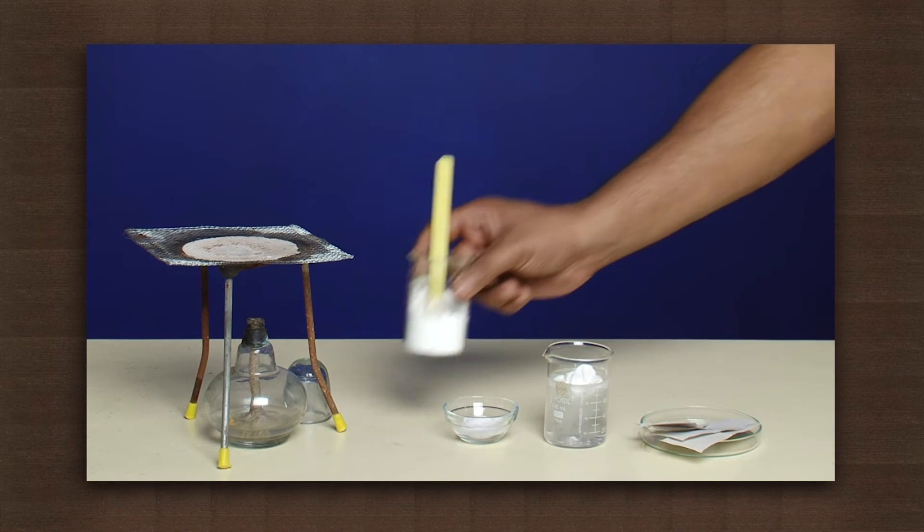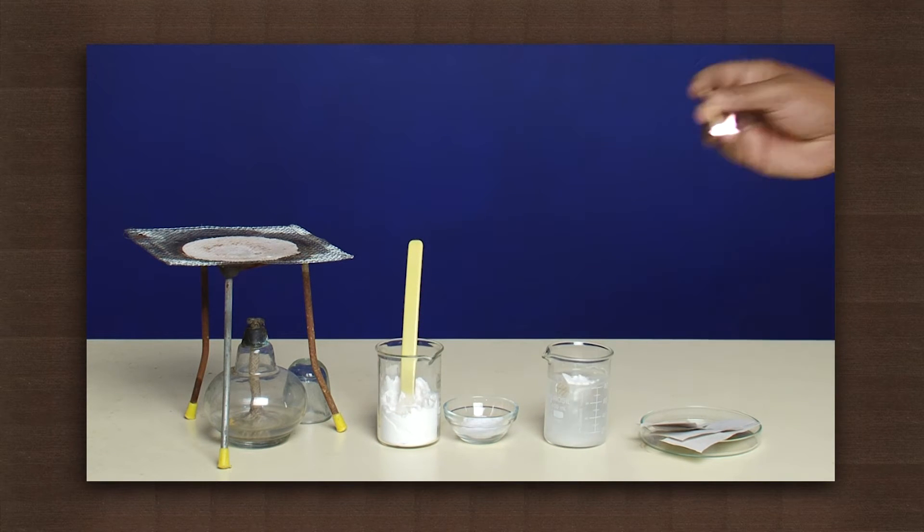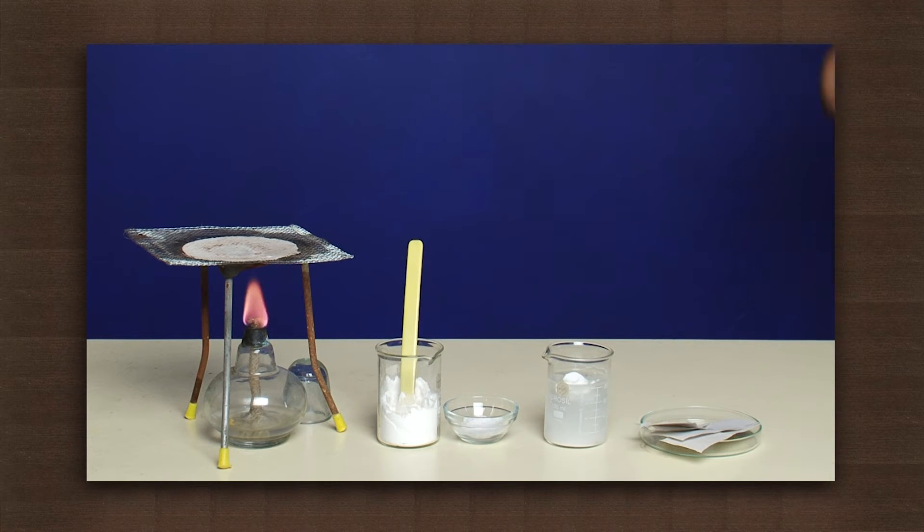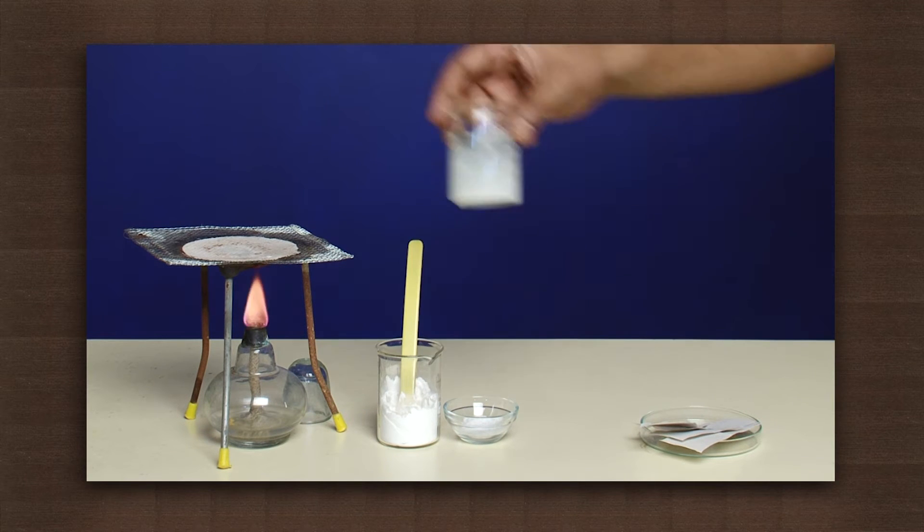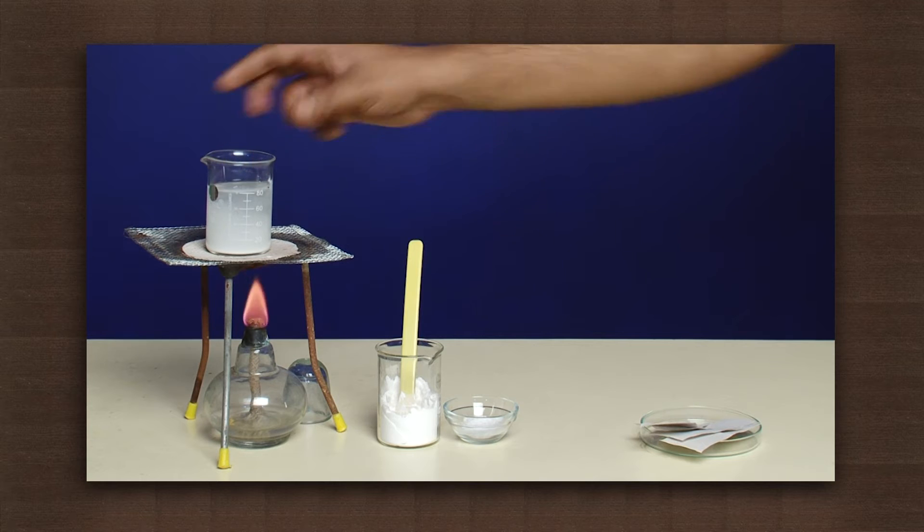Light the spirit lamp and heat the beaker. Stir the starch powder in water.